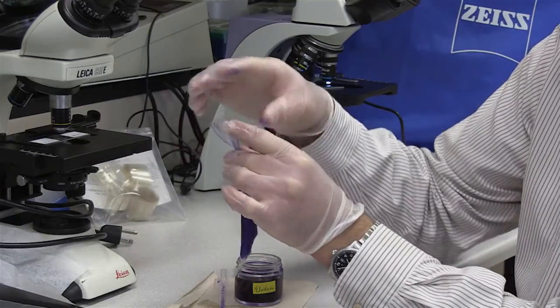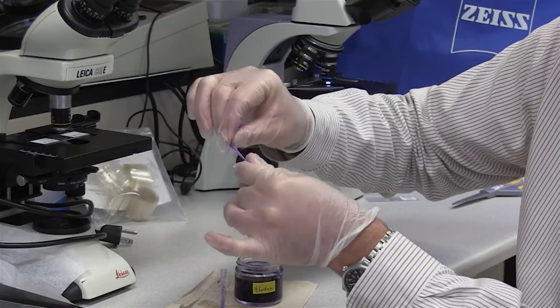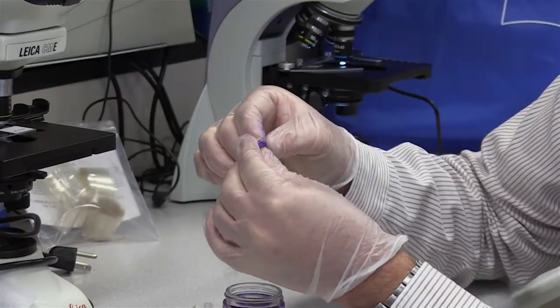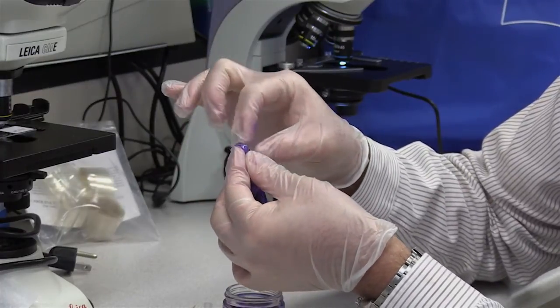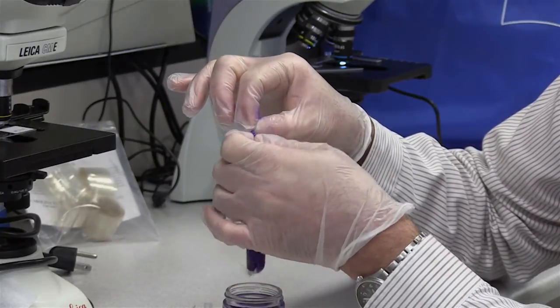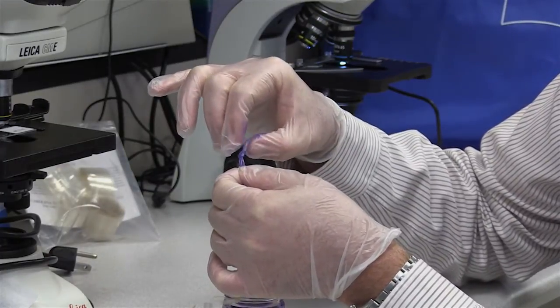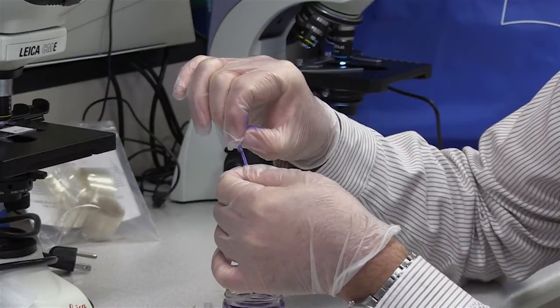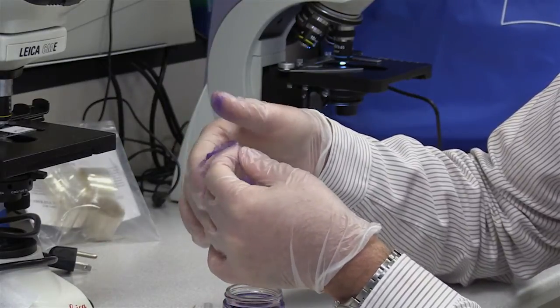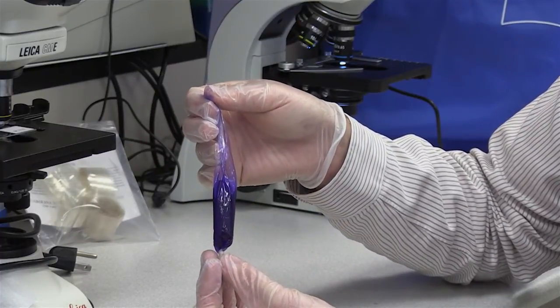The next thing I need to do is tie an overhand knot in the other end. And it's important that I get that overhand knot just as close to the end of our tubing as possible. So I'm slowly working that knot up, and then I'm going to pull it tight when I have it at the very end. And you can see that this is sticking together because I have no air in the tube. So this is how to make a cell using dialysis tubing.